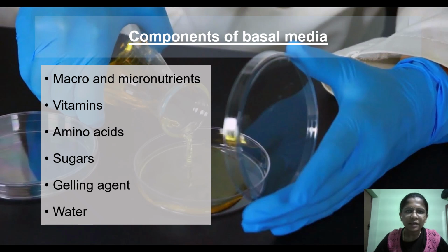But in tissue culture techniques, here we have to provide the same condition for the plant to develop properly and also to produce a healthy planting material. So whatever vitamins, amino acids, everything, we should supply artificially. While preparing the macronutrient and micronutrient stock solutions and the entire media, there can be contamination. So this has to be avoided in order to achieve success in tissue culture.